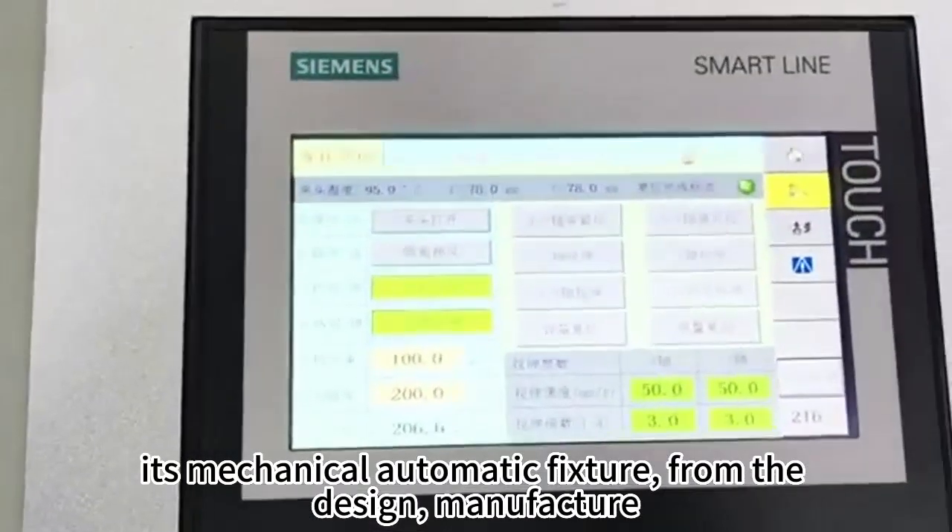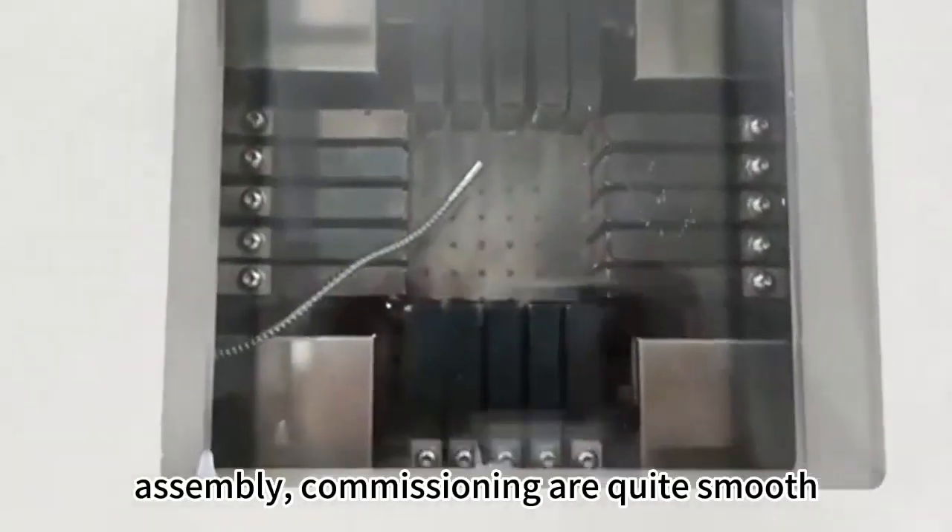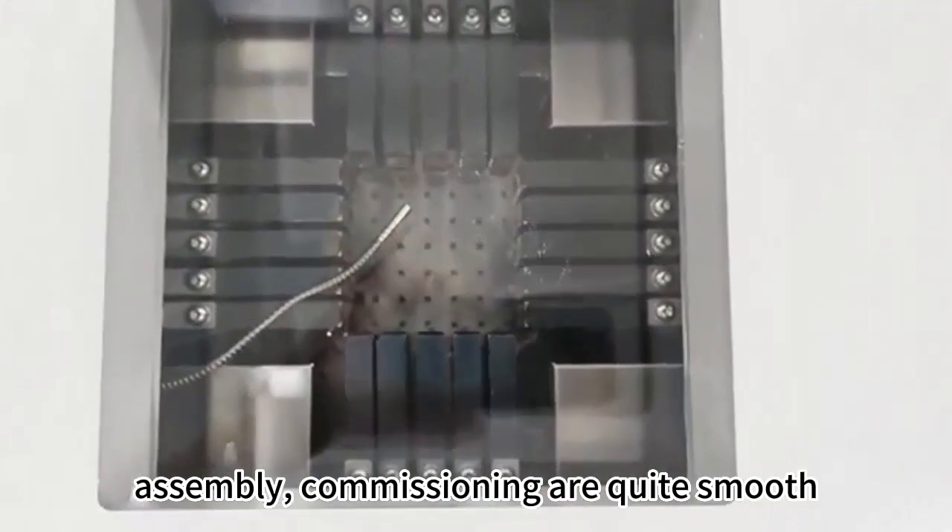Its mechanical automatic fixture, from the design, manufacture, assembly, commissioning are quite smooth.